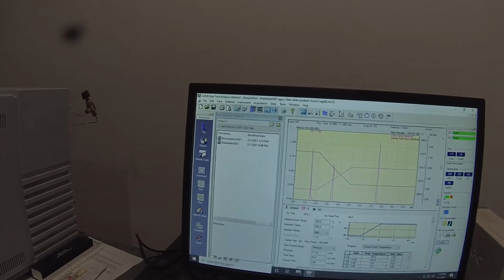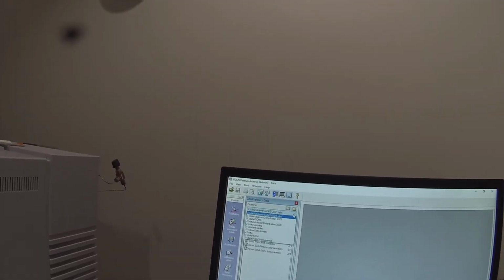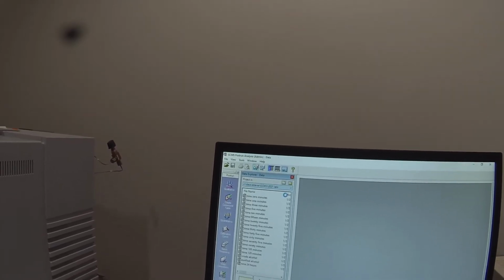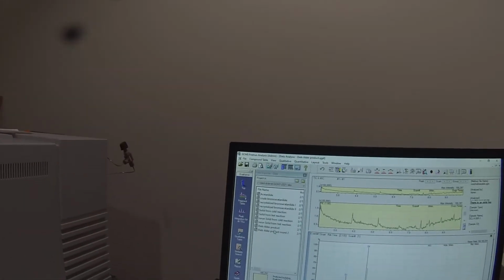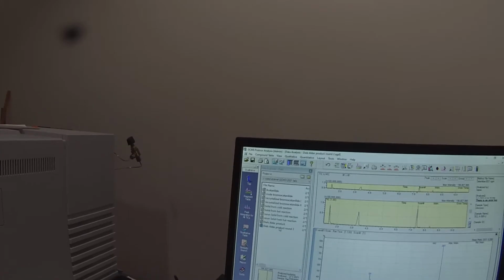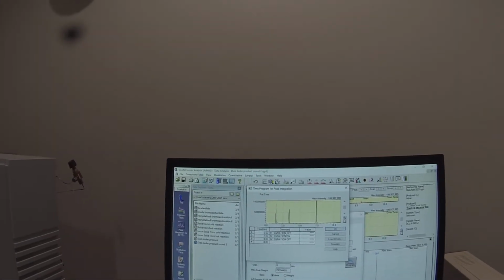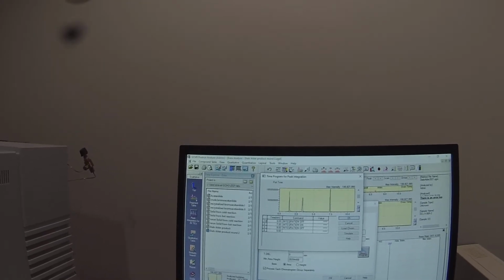So we're going to go to the post-run analysis software, and I will have to open and close that file again. We're going to open the Diels Alder product round 2. Well, Diels Alder product round 1 had nothing in it, so we're going to open that Diels Alder product round 2 file. It has integrated only that peak, but that's because we have the program set to turn the integrator off at time 0 and on again at time 7.